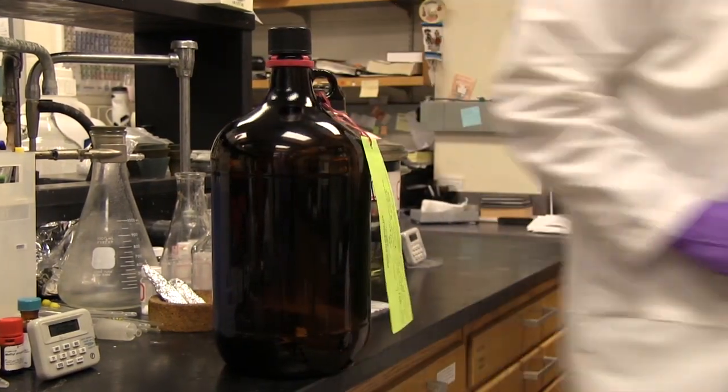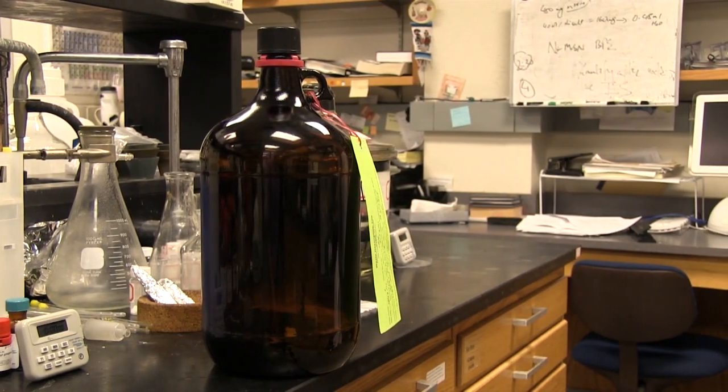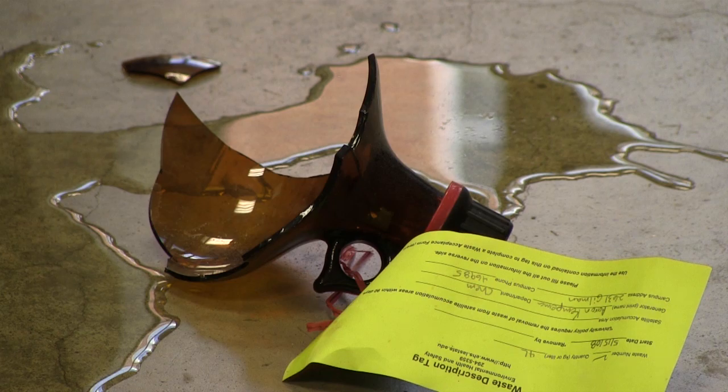You place a bottle of chemical waste on the counter and step into the next room. Then you hear a loud crash. You return to find your bottle broken on the floor.